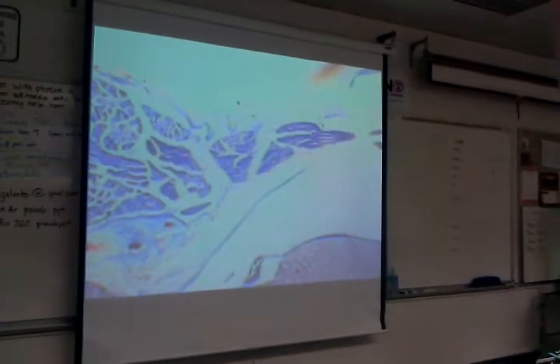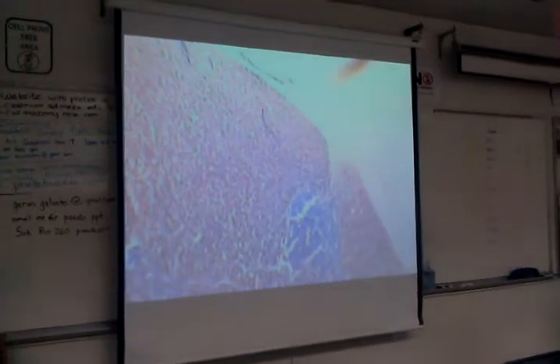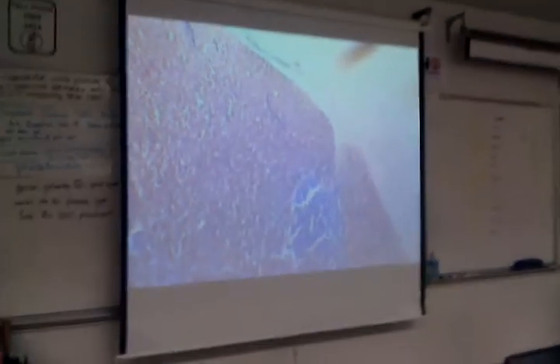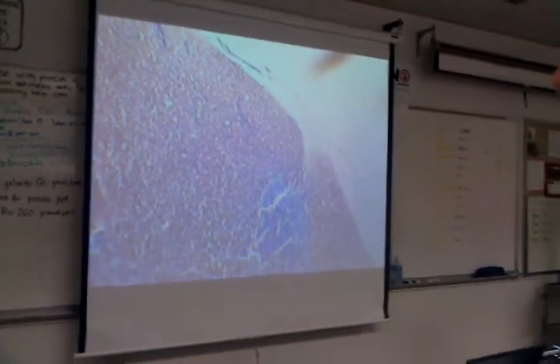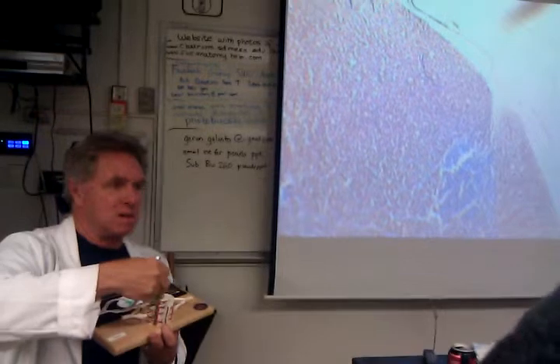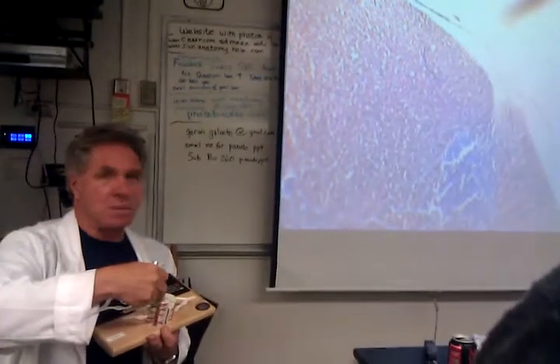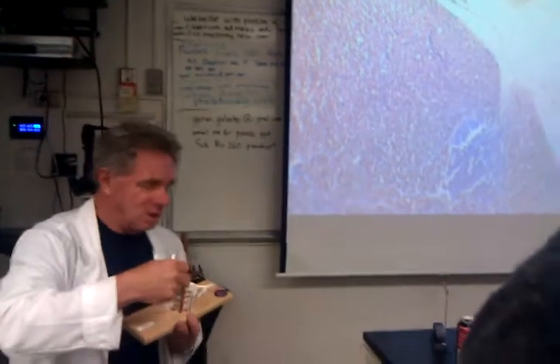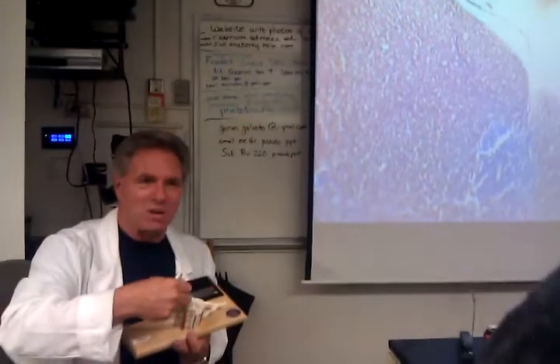Now it's all chopped off, but it's going to continue, and it's going to enter the cord right here. Right. So this thing is the dorsal root ganglia. What we just followed was this, although it's kind of chopped off, and it enters the cord right here. This is the posterior gray horn. Or do they call it dorsal gray horn? I can't remember. Posterior. Okay. Posterior gray horn, right there.